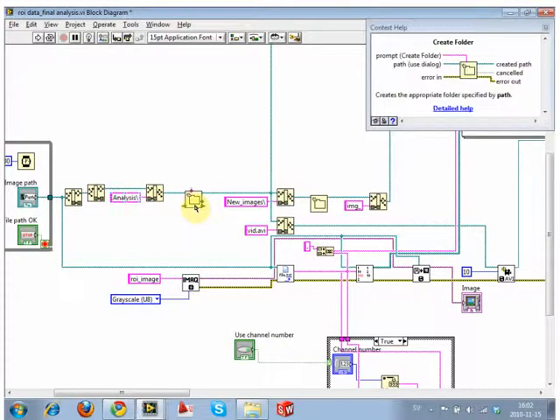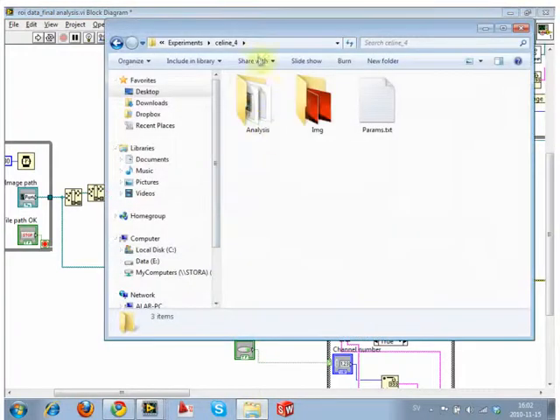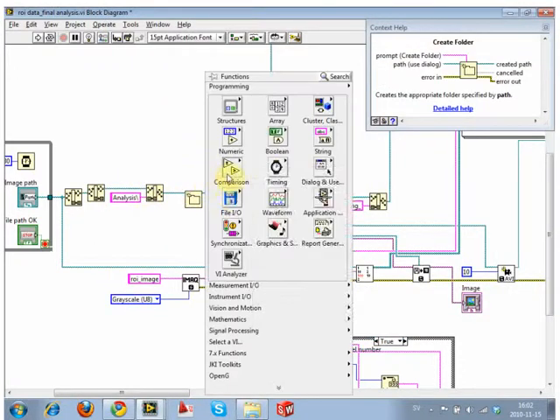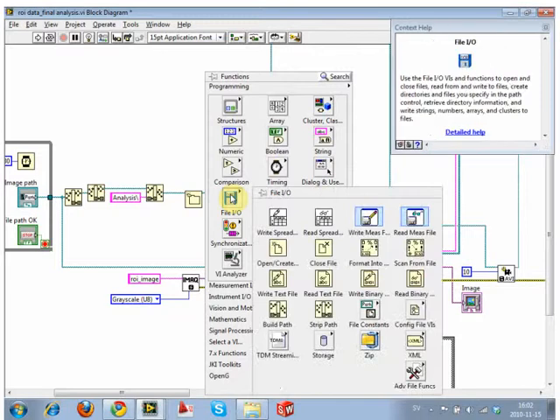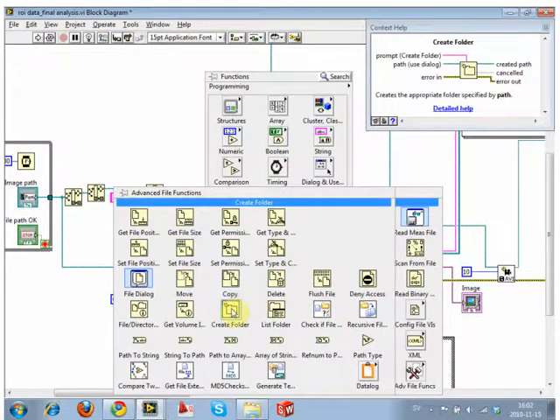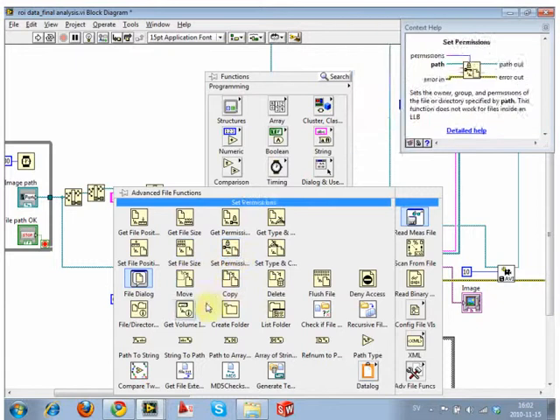But yeah, so we write this folder, which is this folder here in the top level. So you have to put this other VI there to make sure that this folder is created, the next one. Exactly. So I was a little shocked that they put this in the advanced section, but again, make a folder apparently is in the advanced section at the file handling. Some of these things have a good point why they're here, but the create folder thing, I don't know why it's there.